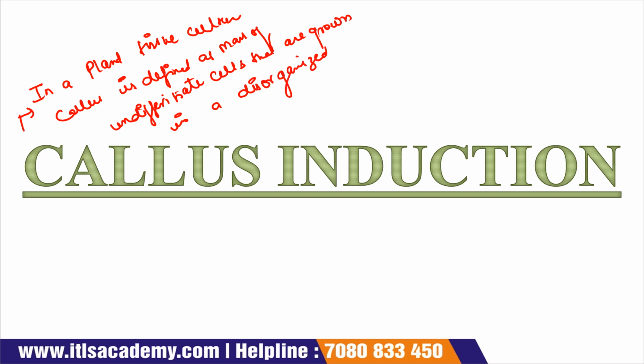Simply, callus is a mass of undifferentiated cells and they can be grown in a disorganized manner.